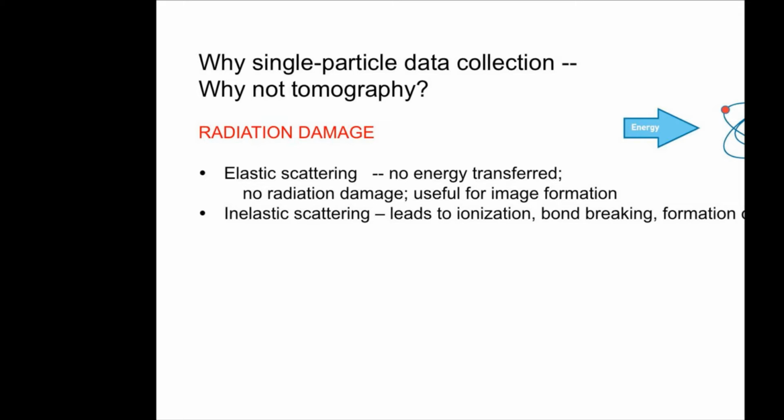With elastic scattering, no energy is transferred, no radiation damage, and these electrons are useful for image formation. Elastic means no dissipation of energy.